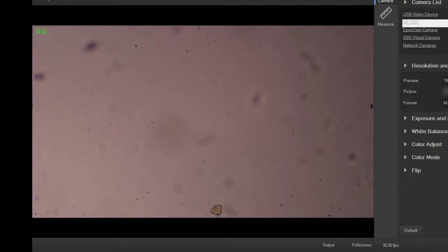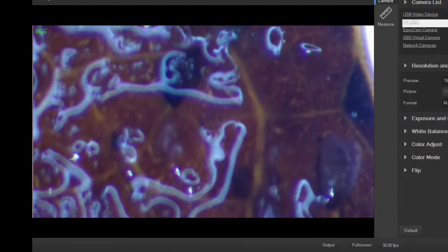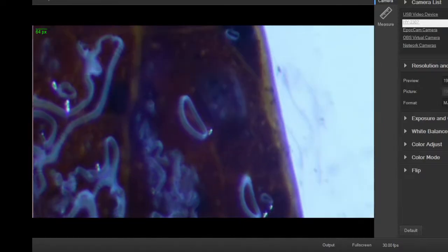It's doing some nice walking on the leaf here. Check this out. This is kind of cool. Oh, it might make your skin crawl if you imagine this guy coming up to bite you. Definitely looks more like a tick here than those other things that I thought were mites. Don't see these very often, so it's hard to tell.